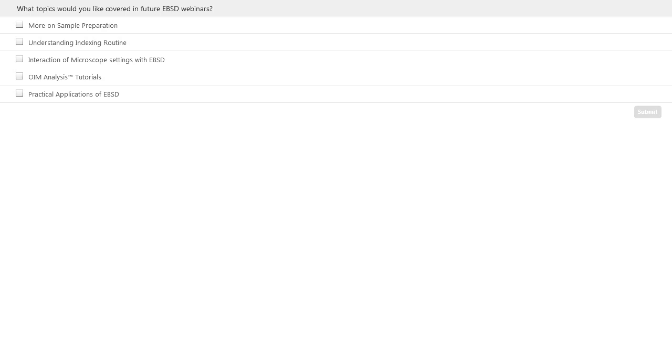So the first question I currently see is a question about dynamic background corrections, and specifically with a polymer composite. I'm not entirely sure what you mean by polymer in this case. With plastics, plastics and EBSD usually don't mix because they don't diffract very well and they tend not to be all that crystalline.